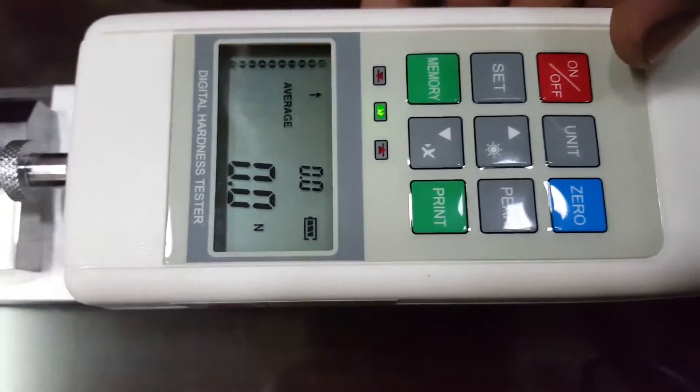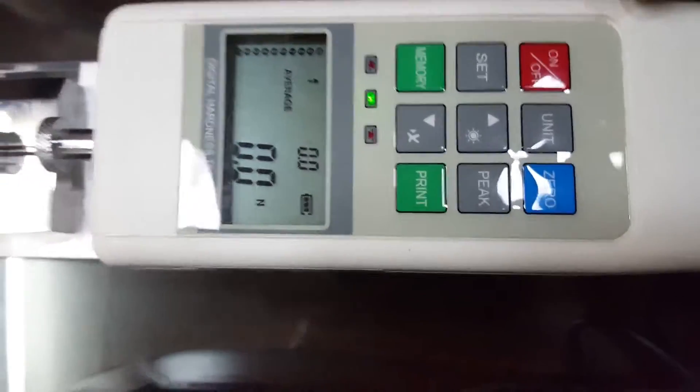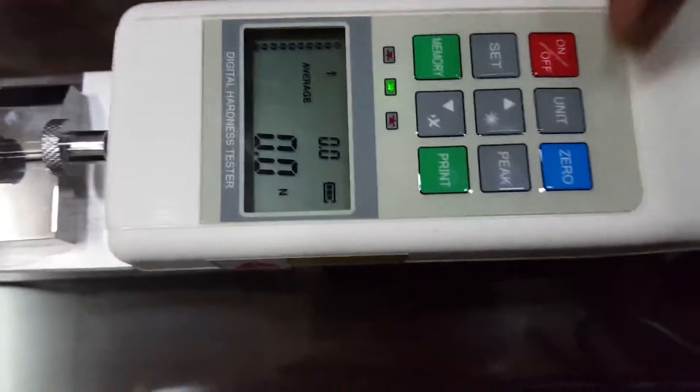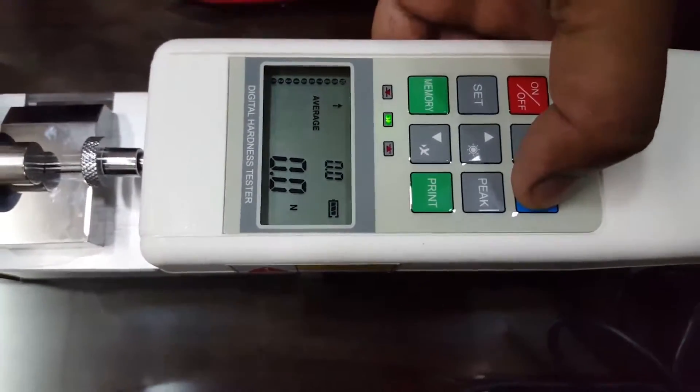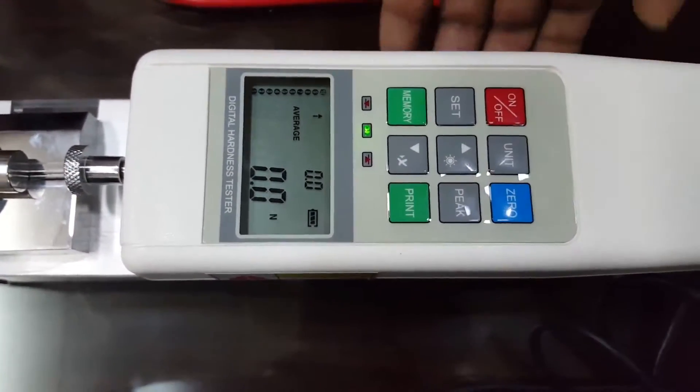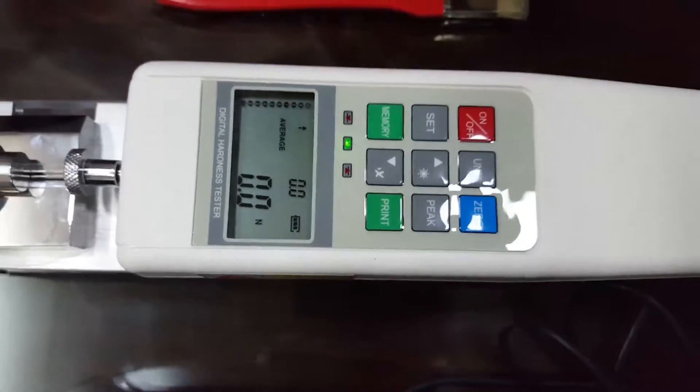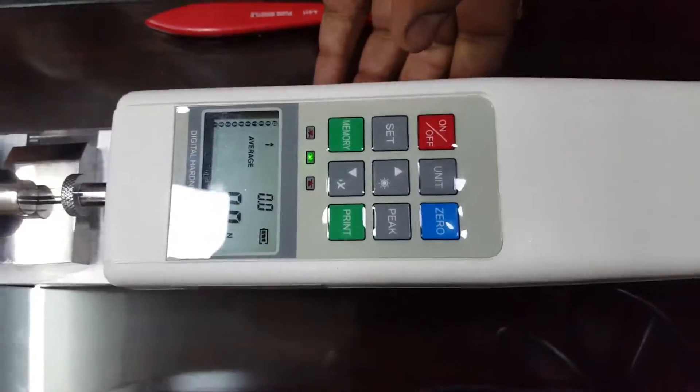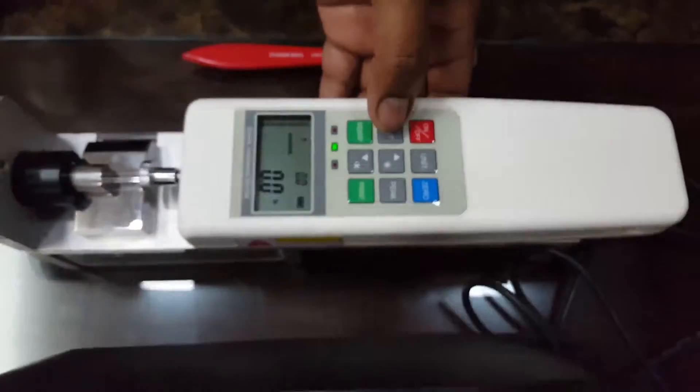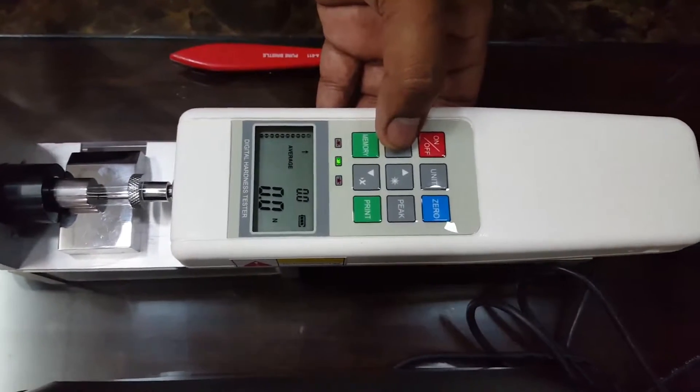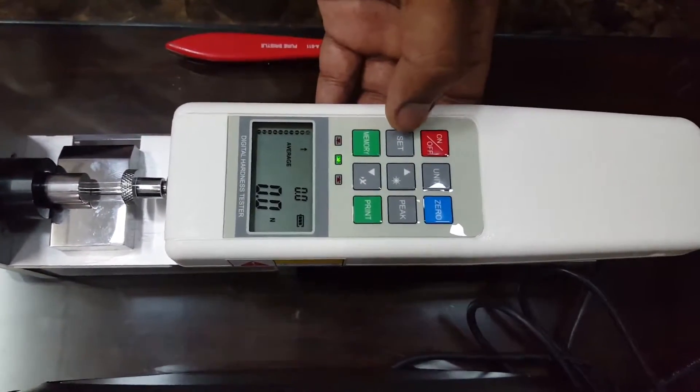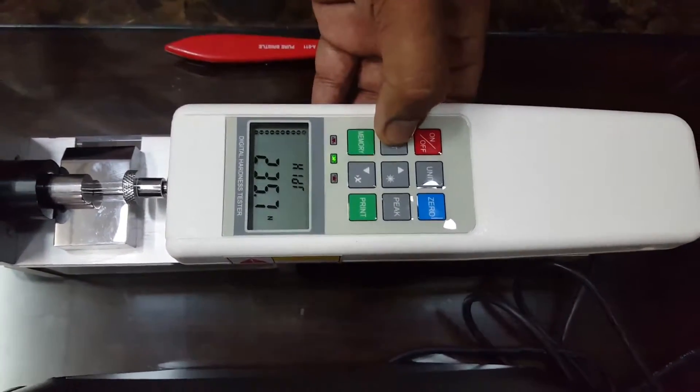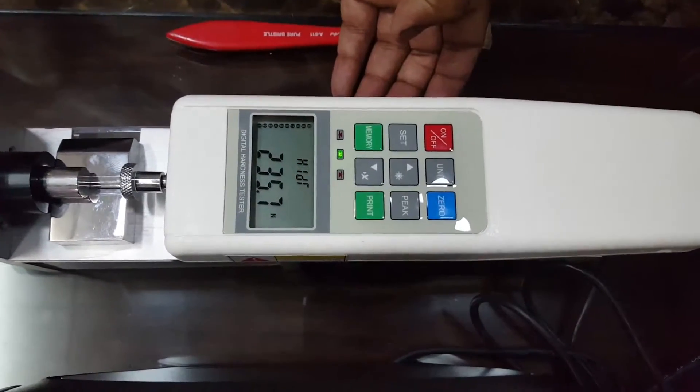Zero is to reset the reading to zero. The Set feature is to set the L1, L2 or H1, H2 limits. We can program the limit from L1, L2 to H1 and H2.